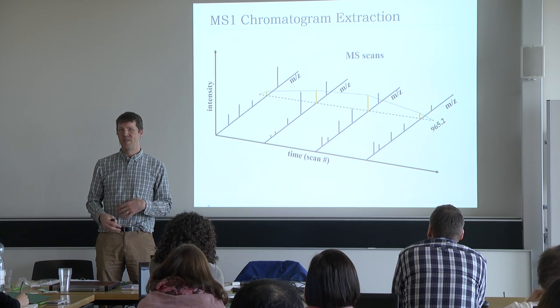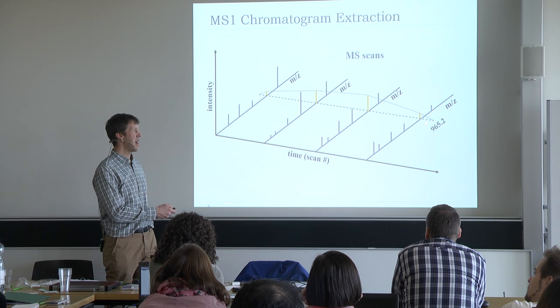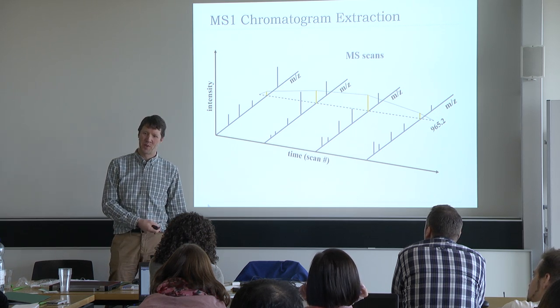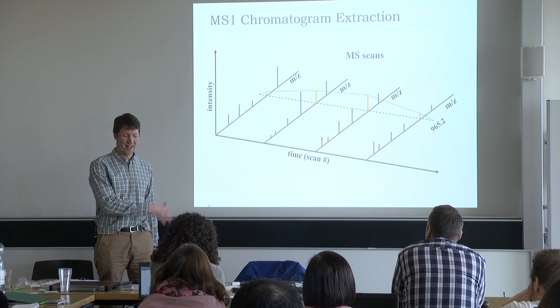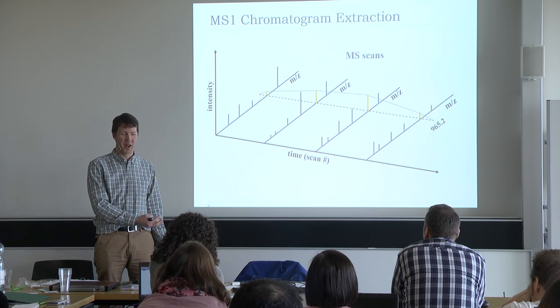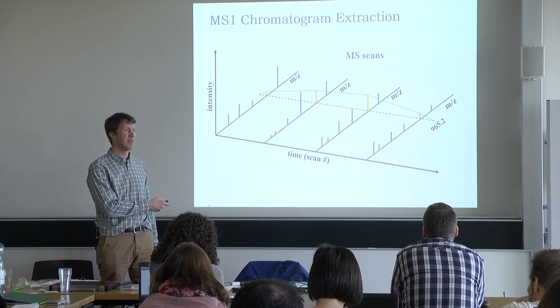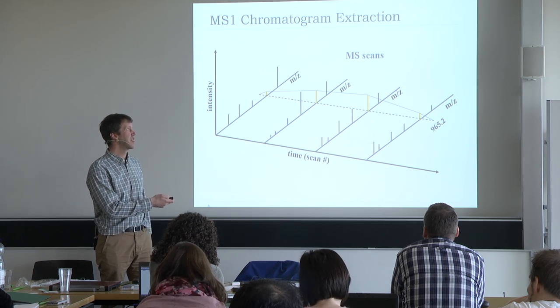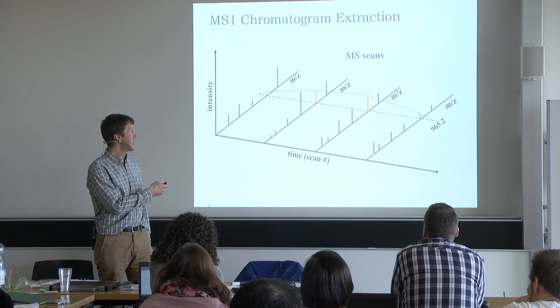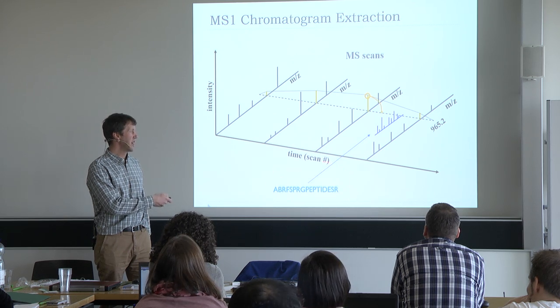For complex samples, we believe that DIA swath is better than MS1 quantification from DDA data, but for simple samples, actually, MS1 extraction works very well, and it works very well for many things, and it's the principle that a lot of software has been based around, and certainly this is what MaxQuant is doing as well, taking chromatograms out of MS1, and then using the spectrum matches.